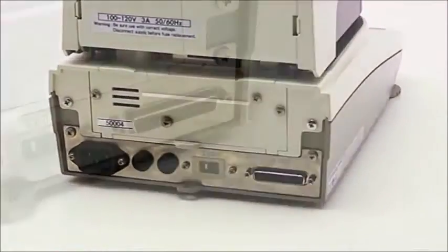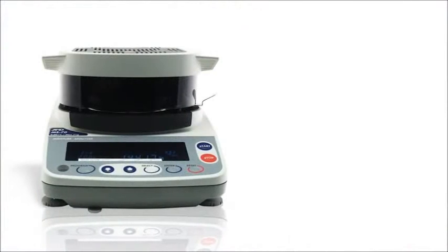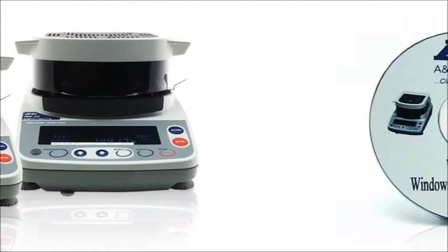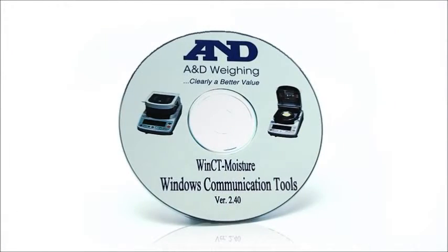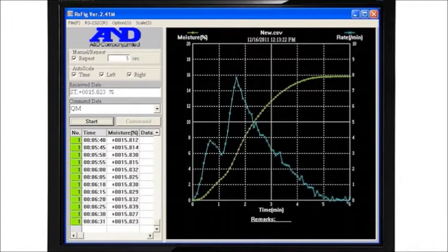Computer control and data export are easy with built-in RS-232. With the MS-70 and MX-50, you also get A&D's WinCT Moisture Software, which displays both moisture and moisture rate changes over time.